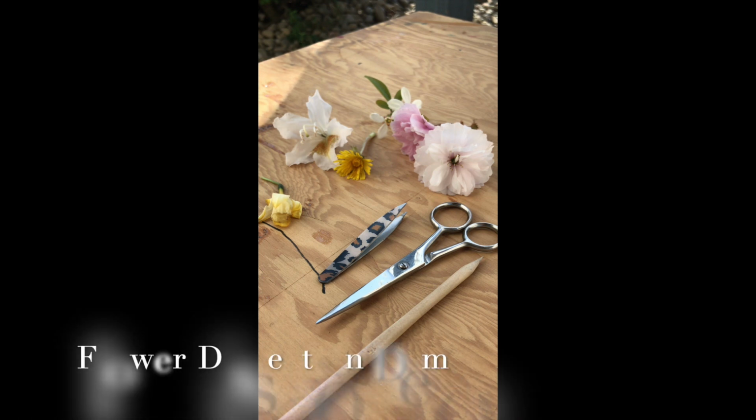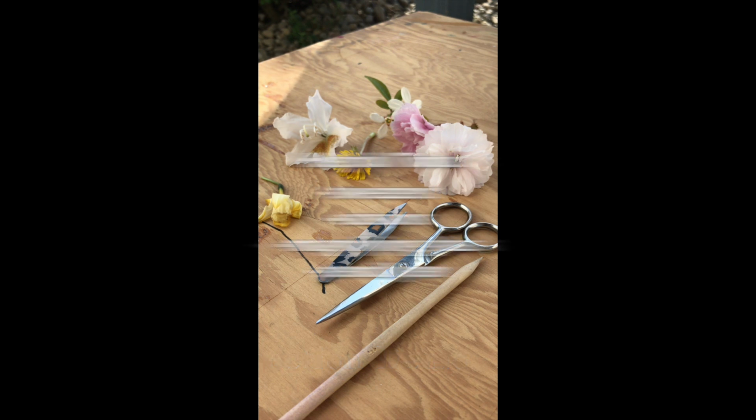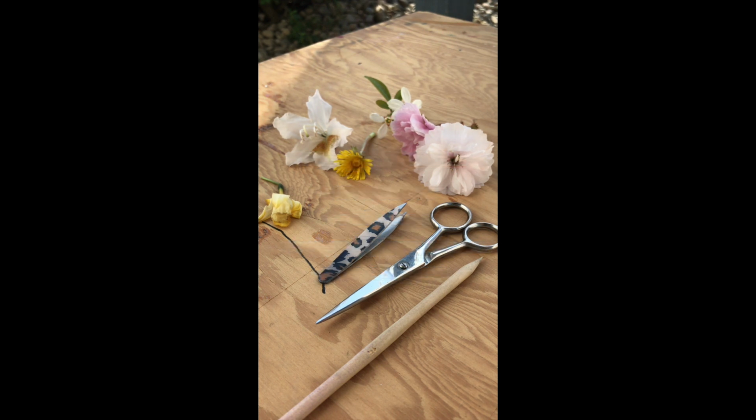This week, your due assignment is to dissect some flowers, and so this video will just walk us through. I'm going to be dissecting a few flowers for you and also just showing you what you're going to be looking for and talking through some of the vocabulary words that you're going to need to know in order to do that assignment.